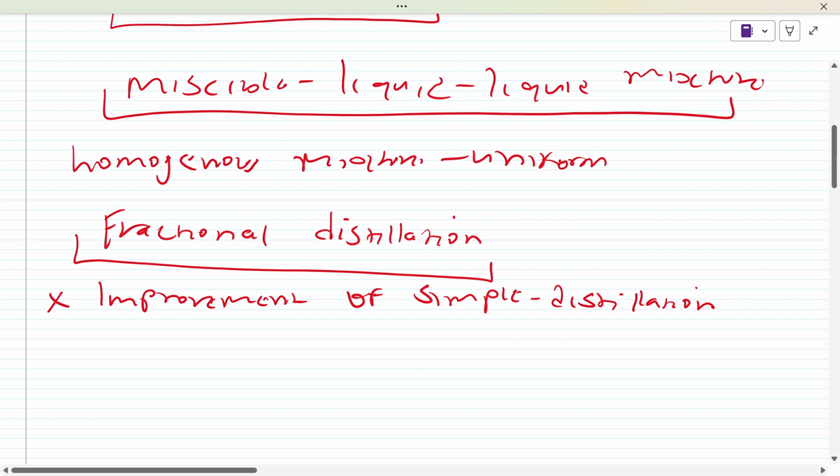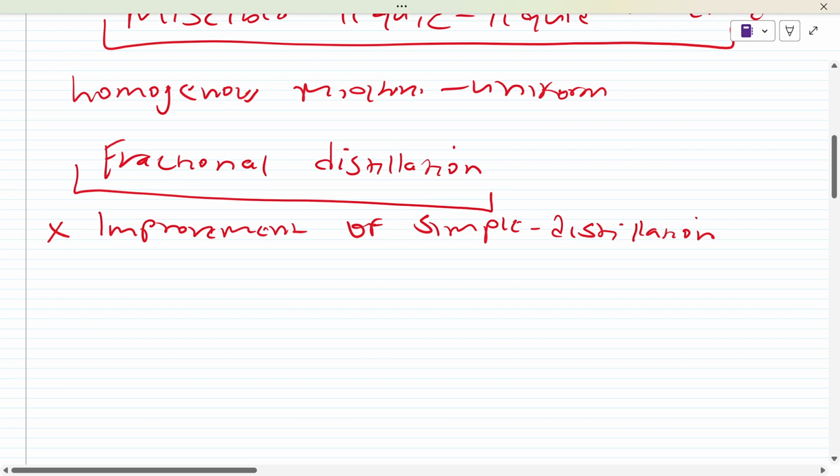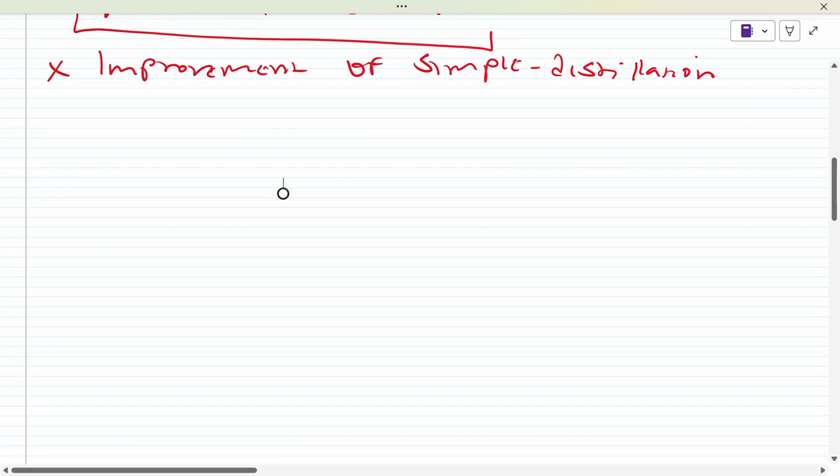And in this video, I'm going to dive deep into fractional distillation using a sketch and explaining every bit of it. Now, if I'm going to do that, this is how we are going to start. Let me start with the drawing. And we are going to analyze the drawing and know some of the important parts that we really need to be knowing in those drawings. Now, here, I'm going to start with my flask, the way I started in the simple distillation.